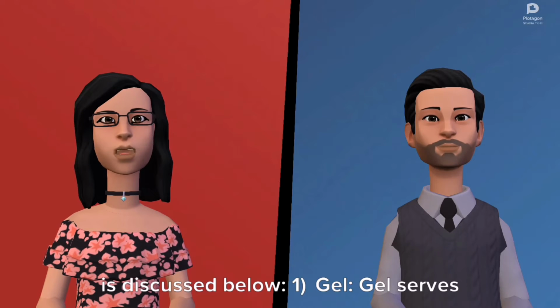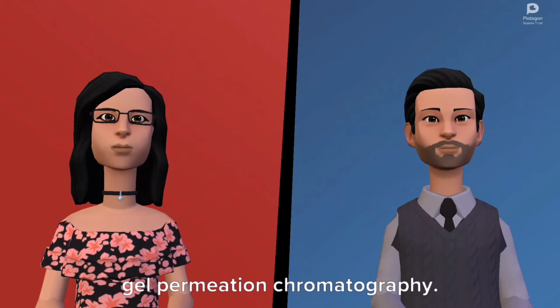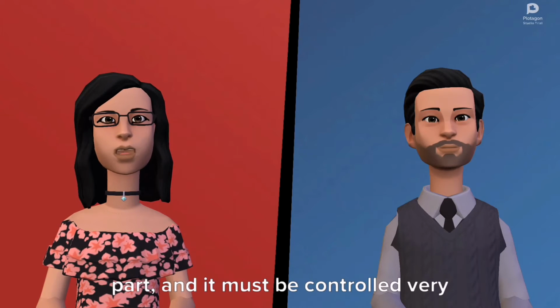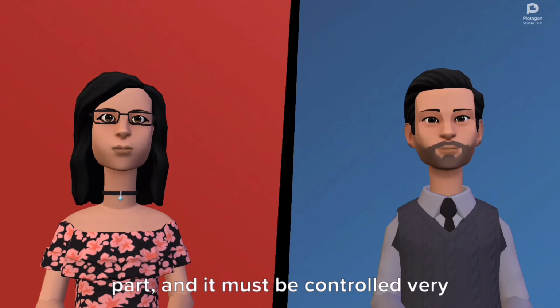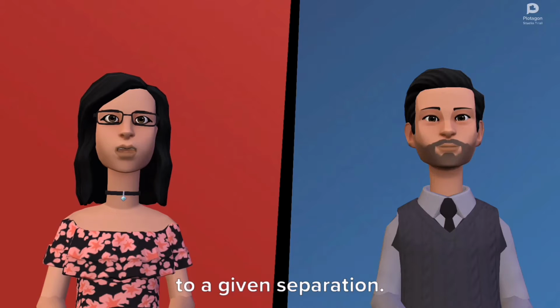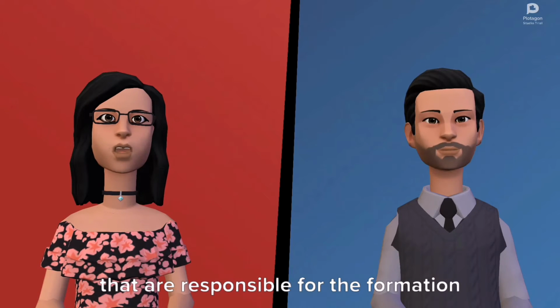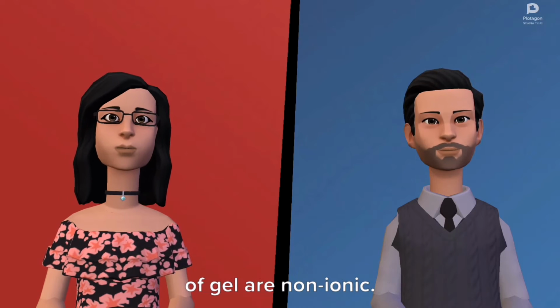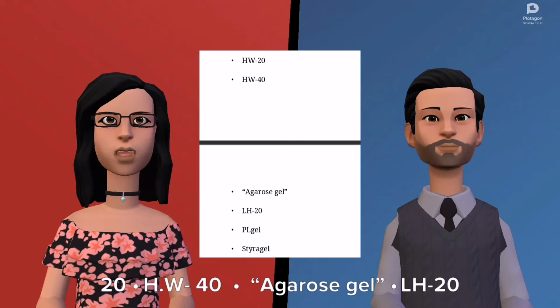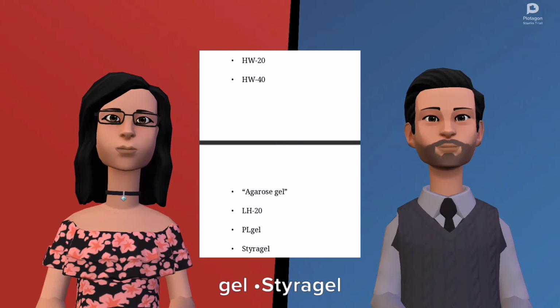1. Gel. Gel serves the purpose of stationary phase in gel permeation chromatography. Pore size of the gel is the most crucial part, and it must be controlled very carefully so that it can be applied to a given separation. It is generally advised that the agents responsible for the formation of gel are non-ionic. Some examples are HW20, HW40, agarose gel, LH20, PL gel, styragel.